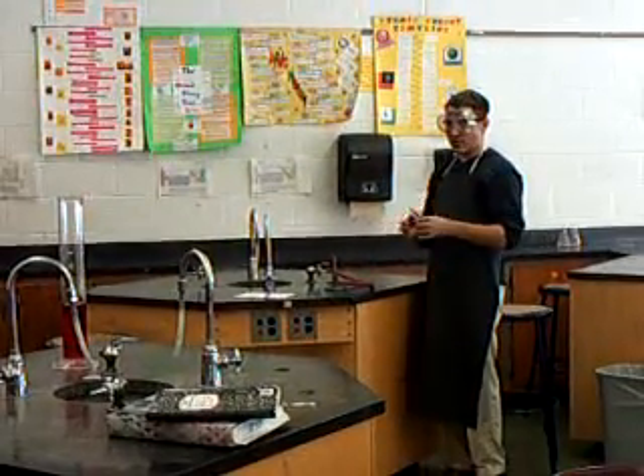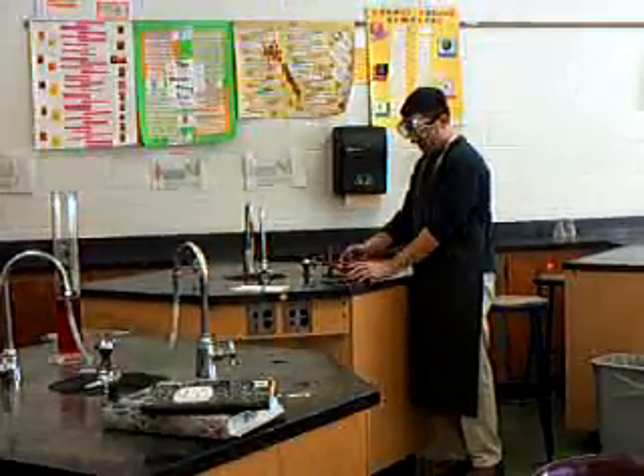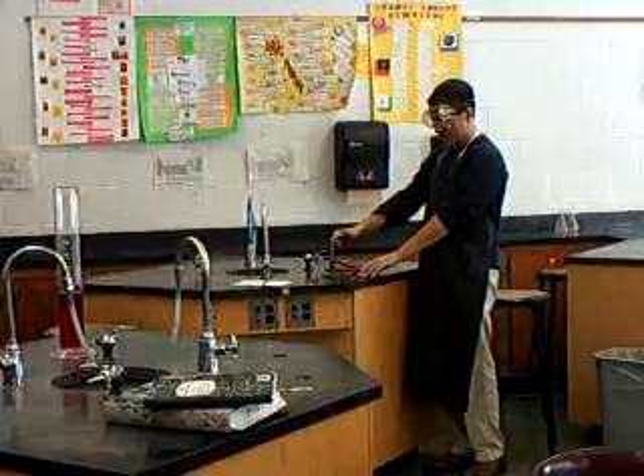Staying far away now. Depending on what you have, you might have a spark lighter, a normal lighter, or a torch lighter — whatever. Keep your hands far enough away, keep your face away from it, and light it up.